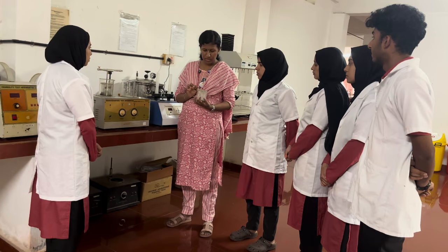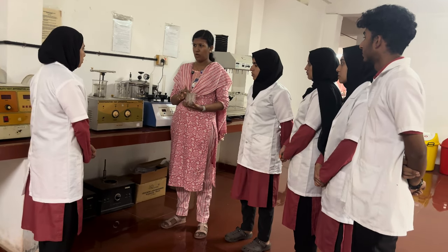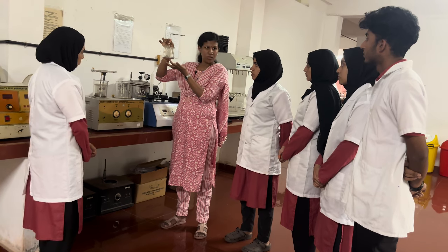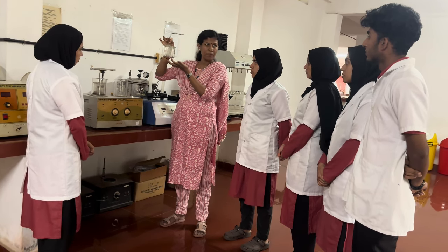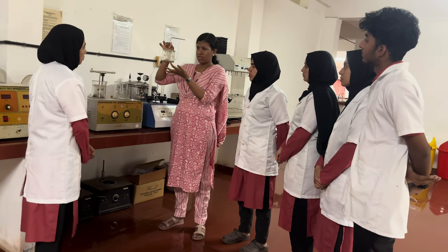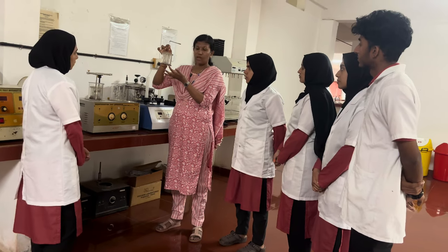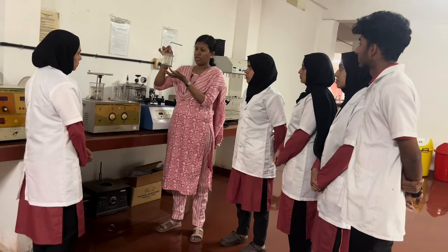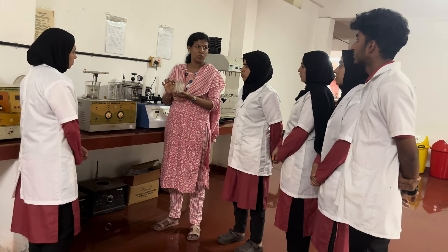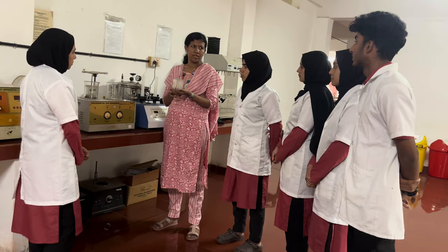What is the specification of these glass tubes? These are open at the top, and what about the bottom? They are closed at the bottom by a wire mesh screen, and this wire mesh screen is made of stainless steel. Okay, and this is 10 mesh size. Sorry, the tubes are open at the top and closed at the bottom.